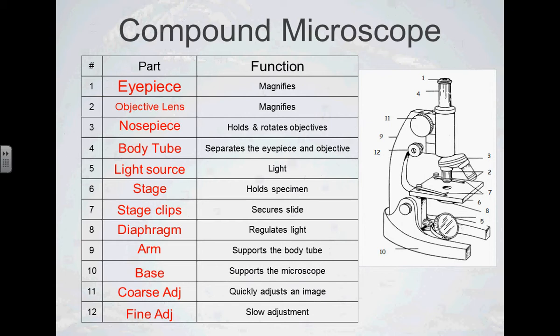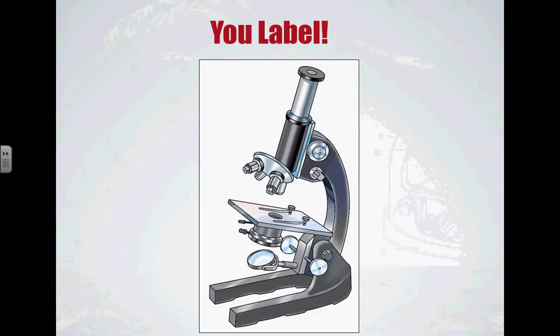Now our microscopes are a little different. Our microscope has just one knob here. We have this larger knob. That's the coarse adjustment on these microscopes. And then the smaller part here, that's the fine adjustment. So those are the parts of the microscope.